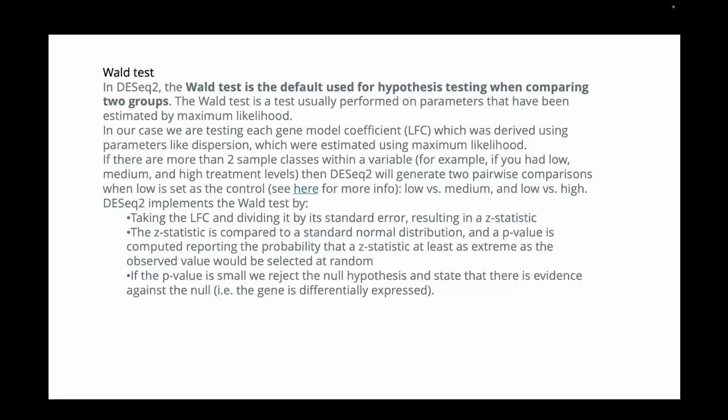Only 5% of the data, or even less than that, have no log fold changes across different tests. So what you can say is, if I pick a data point randomly from the distribution, it is highly likely that it will have a log fold change value which is not equal to 0. It will be positive or negative, whatever it may be. If you randomly pick a point from the distribution, it is highly likely that that value will have a log fold change. And how likely is it? That is how we quantify the p-value.